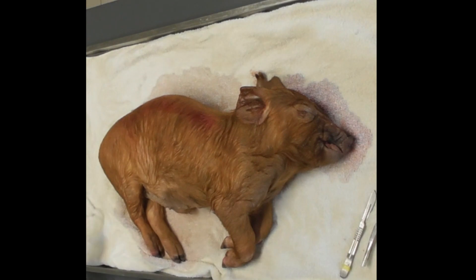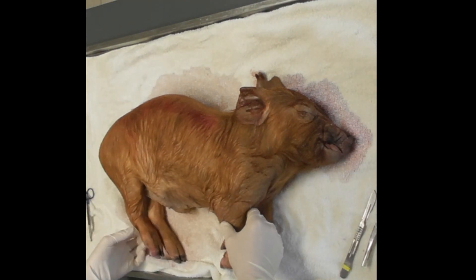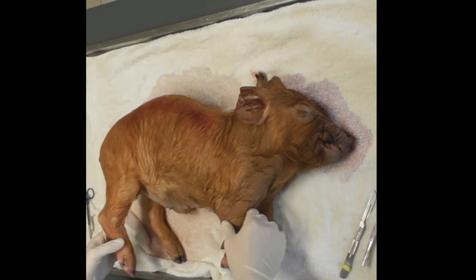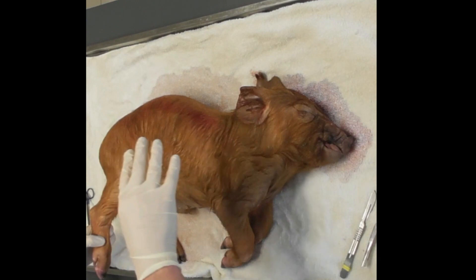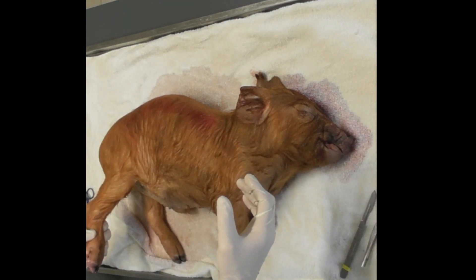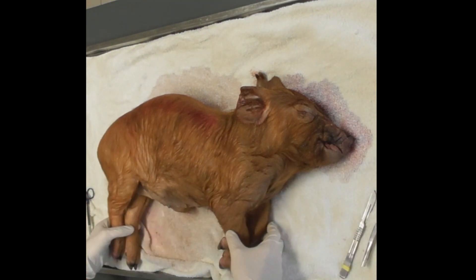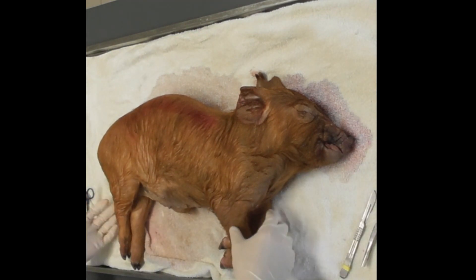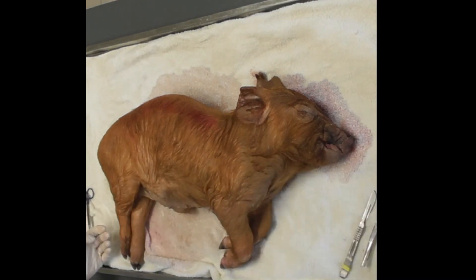The first step is to do a good thorough external exam. I usually do my animals in left lateral recumbency — left side down — because that's what we've been taught, and that's what the pathologists here have taught me. The aim is to make sure you do it in a systematic approach each time, so you almost have a checklist in your head and don't miss anything.